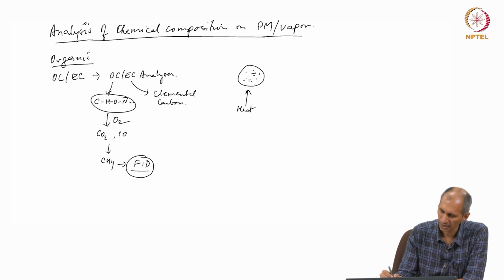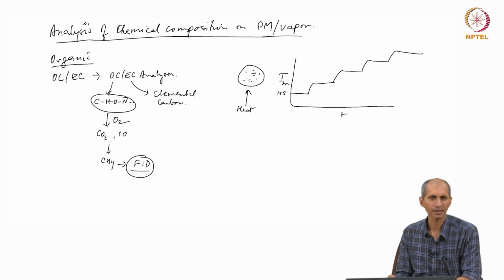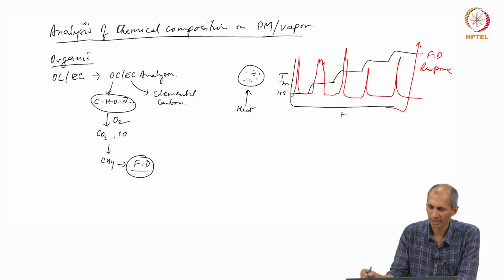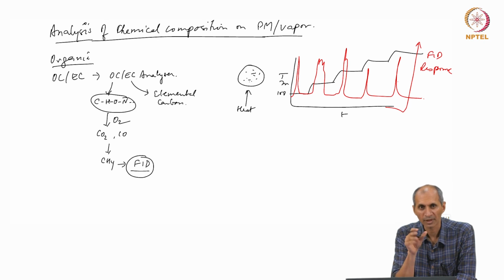You heat it, temperature versus time, at say 100 degrees, then you increase it to 200, then 300, then 400 and 500. At each temperature you keep it for some time. Every time you do this, you get a signal. So, at 100 you will get a signal, then some signal at 200, then some signal at 300, then some signal at 400 and 500. The amount of this red signal indicates the amount of organic carbon which will come out, which will volatilize at that particular temperature.